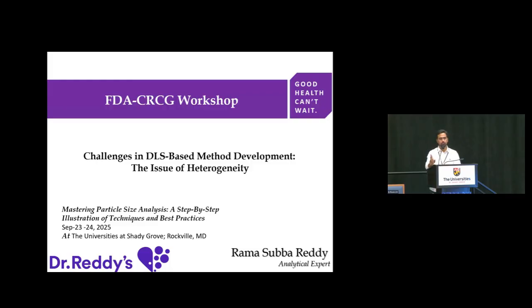So I'll be presenting two case studies. Mostly the first study will be in line with what we just saw from Sandoz. So case study one will be about the challenges in developing a DLS method for a cream formulation. The second one will be the self-association impact of protein peptides.